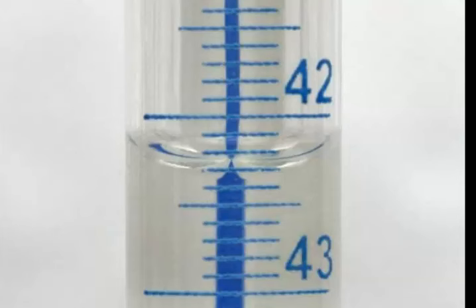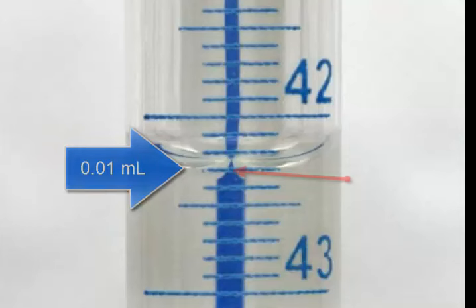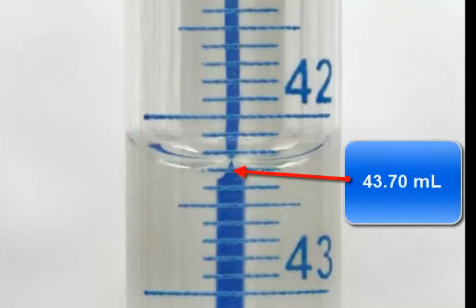If we look at the burette, which is also used for measuring volumes, it is marked off every .1 milliliters. Therefore, we could estimate to the one-hundredth of a milliliter, making the volume 43.70 milliliters.